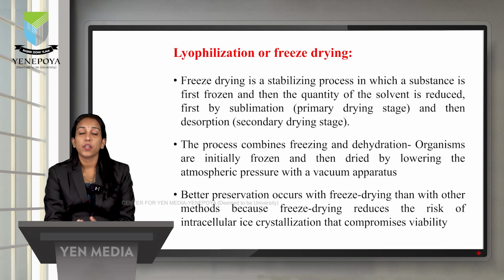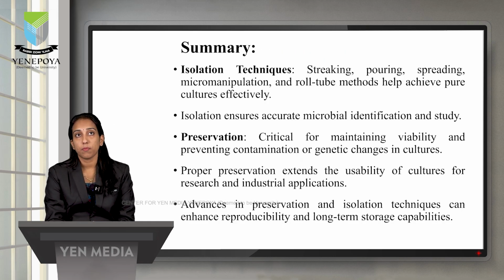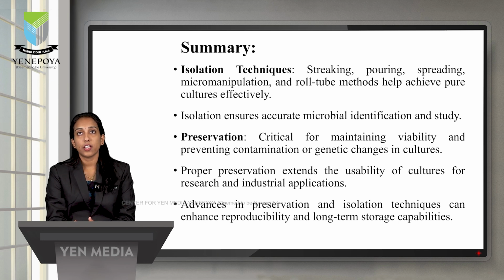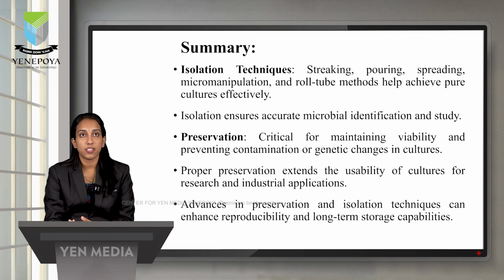So these are the preservation methods. We discussed the isolation methods and preservation methods. The isolation methods are streaking, pouring, spreading, the micromanipulation method, and the roll tube method, which are the isolation techniques for pure culture. We perform isolation in order to ensure accurate microbial identification and study.